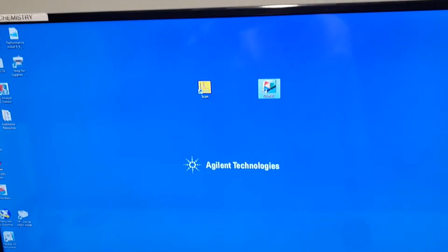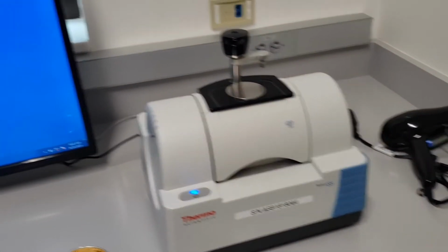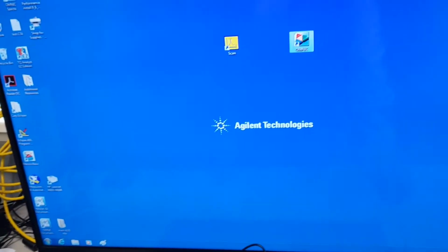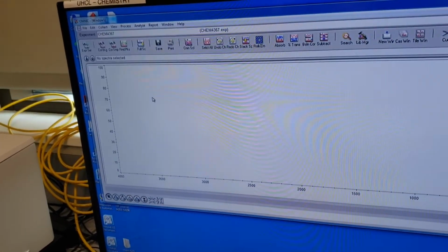Hello, this is Jordan, your TA, and I'm going to show you how to use the FTIR machine using the Omnic software. You first want to open up the Omnic software right here. Click OK, as that's the one we'll be using.